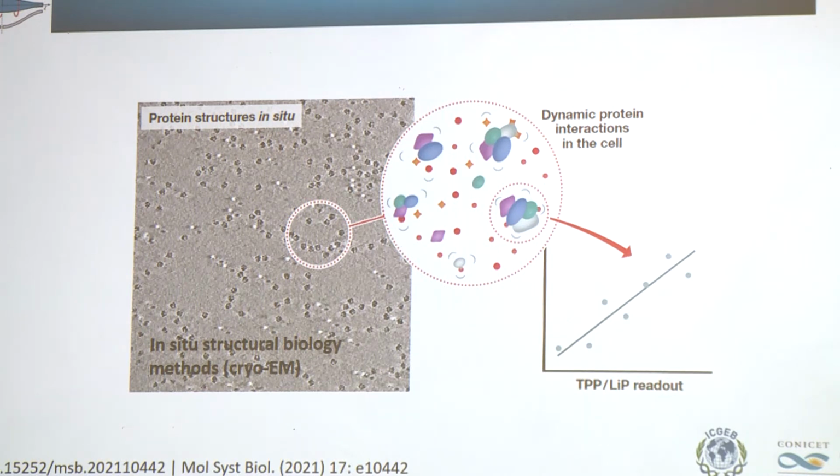Using cryo-EM, you can check complexes that you have detected by thermal stability or LiP-MS, and then see if these complexes can be found in a cryo-EM study.